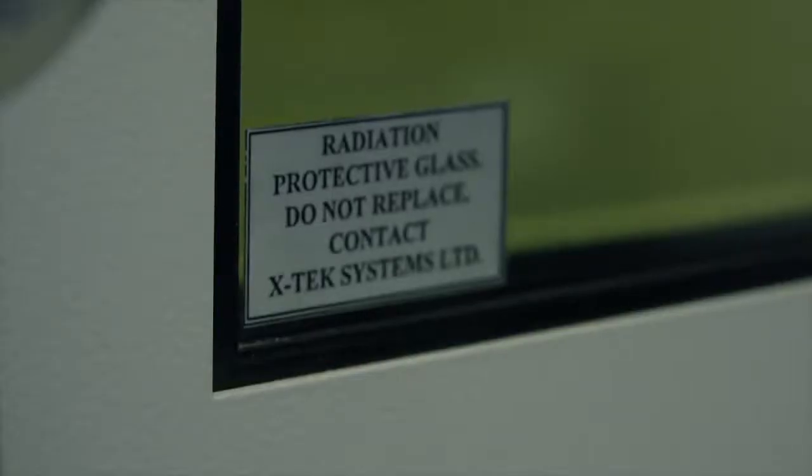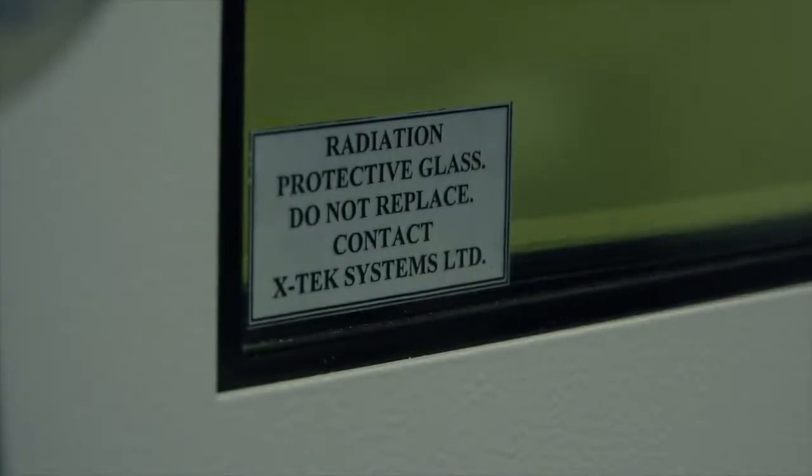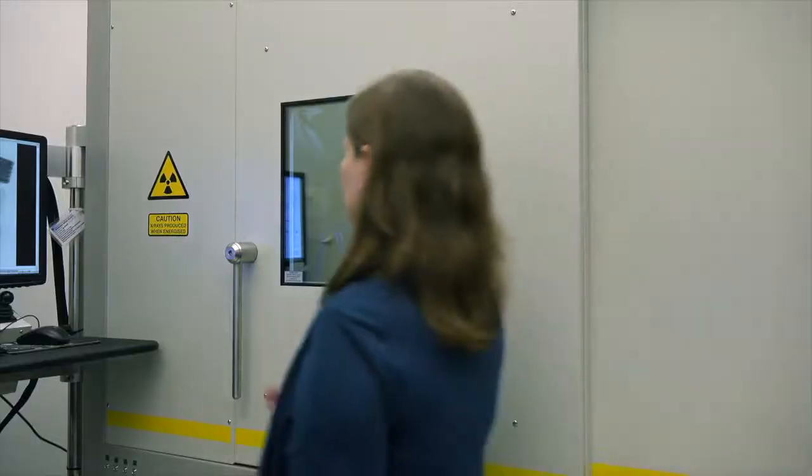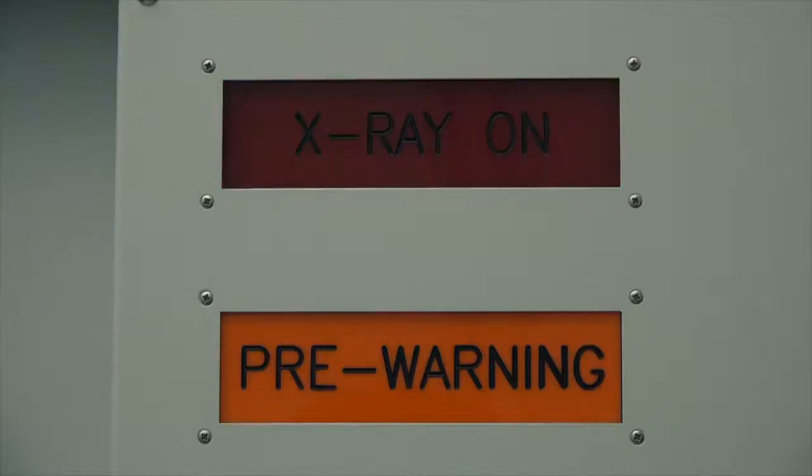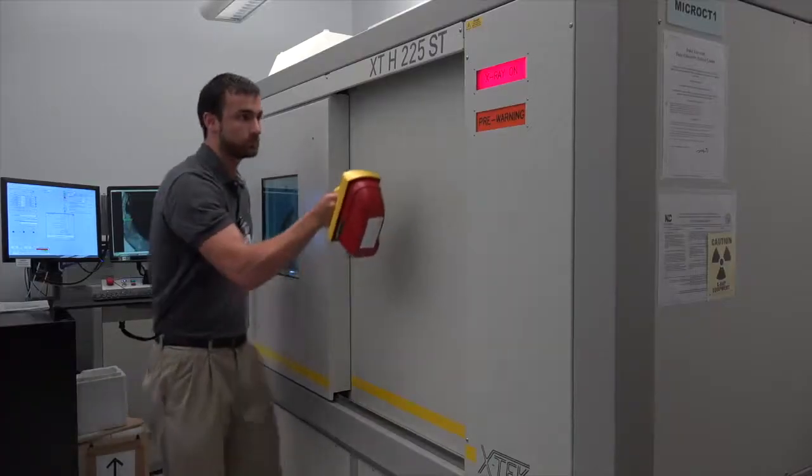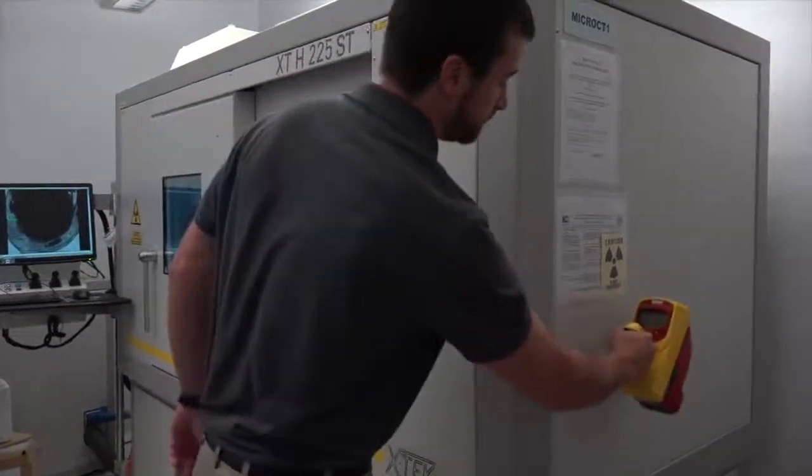The lead shielding is also in this window, so we can view our sample safely. An additional safety feature is that the x-rays cannot be produced when the door is open. Finally, x-ray safety training is required and regular safety inspections are made of the equipment.